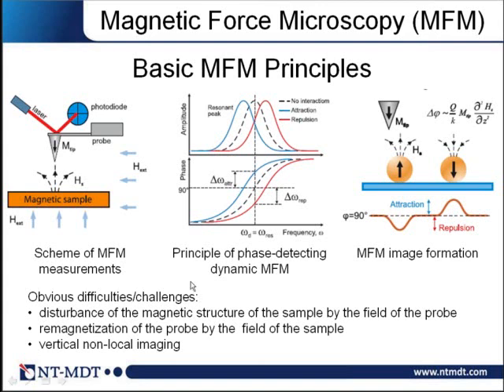oscillations, but its phase. And as you see in this slide, on two examples, for attractive and repulsive interactions, the phase is changing in opposite directions in both cases if you stay at the given frequency, and in such a way one can distinguish between repulsive and attractive forces. In many cases, it's rather important.